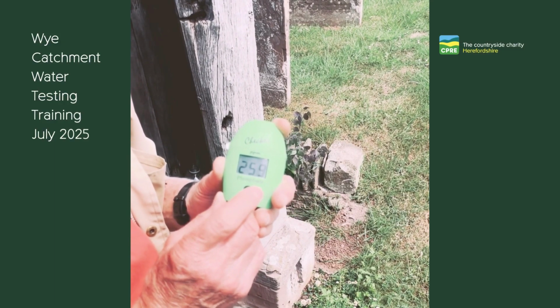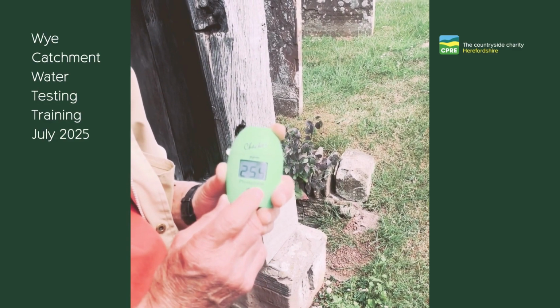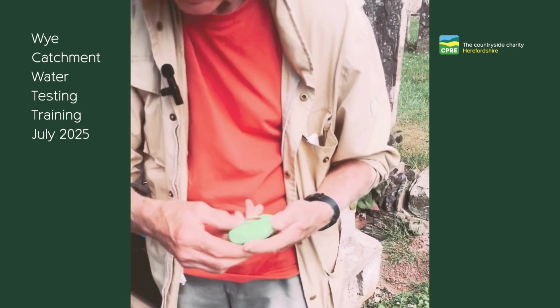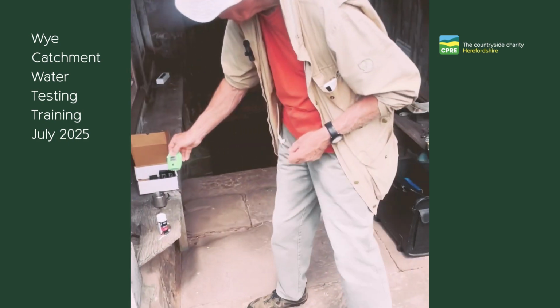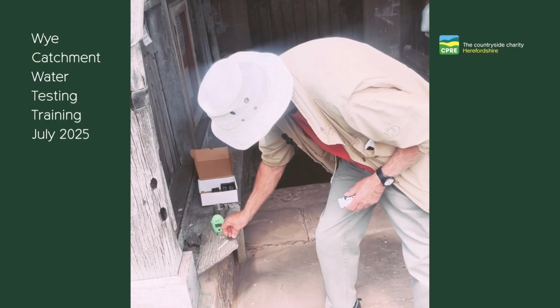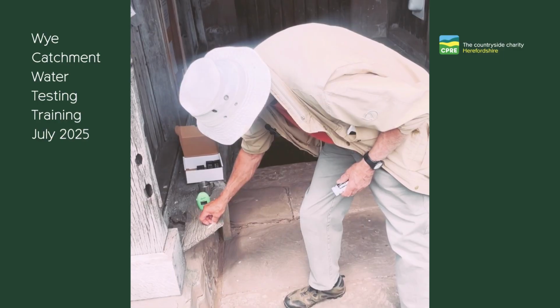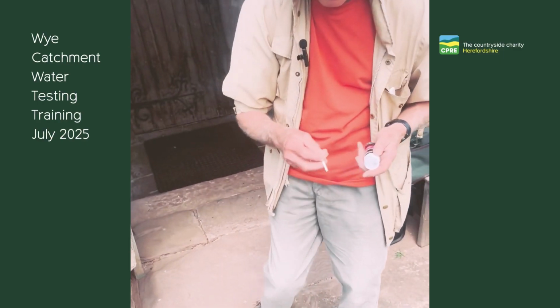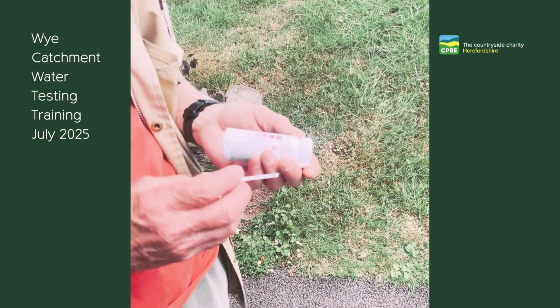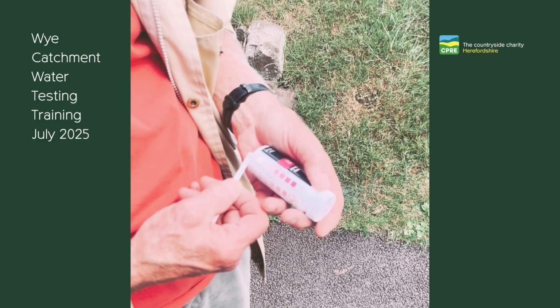There. Now, it has started to count down from 3 minutes. And once that reaches 0, it will give us a reading. So we'll put that to one side, let that happen. And meanwhile, we'll look at the result of the nitrate strip test. This has been standing now for more than 30 seconds, but that doesn't matter very much, providing it's done reasonably soon after the test.